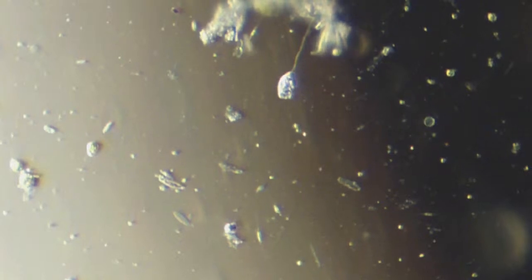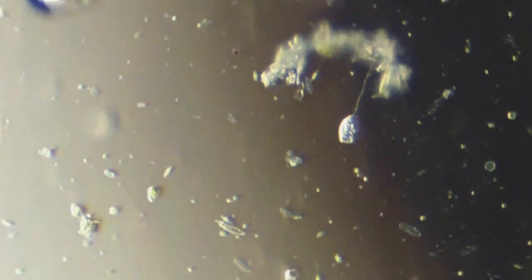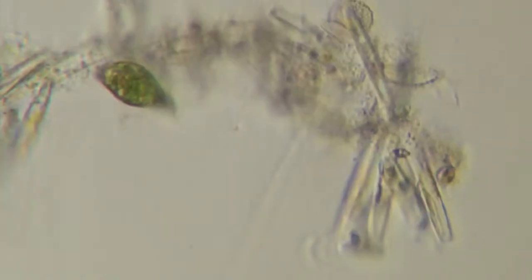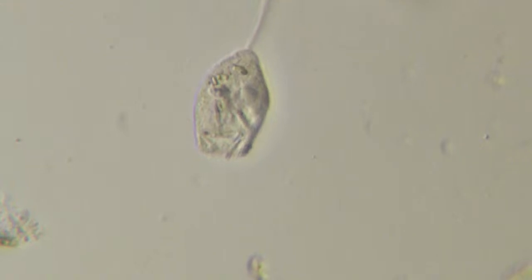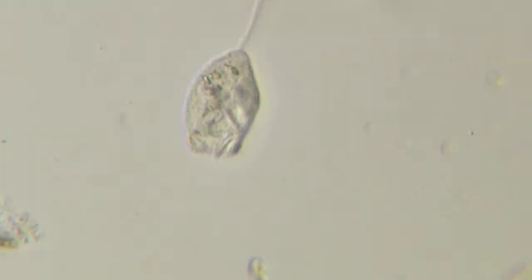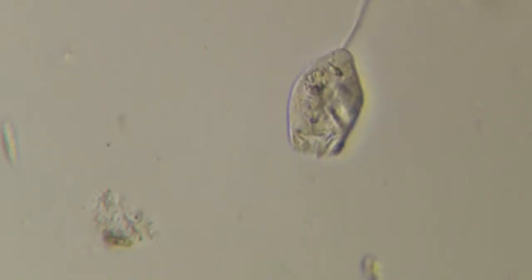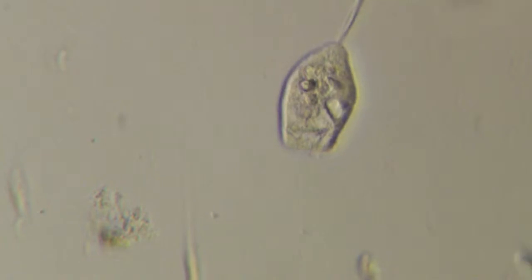There's a Vorticella. And it's moving. It's pumping. See, it looks like a little upside down wine glass. That's a Vorticella. And they have this little crown of cilia that beat at the top of the wine glass, bringing in food. So they basically filter feed, although they're single celled on a stalk, they filter feed just like a clam or a mussel would do.